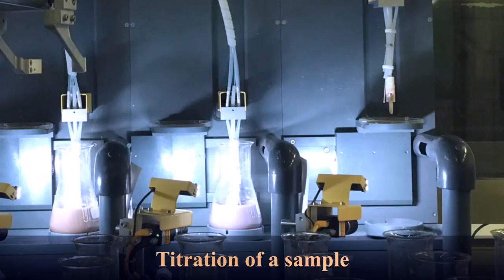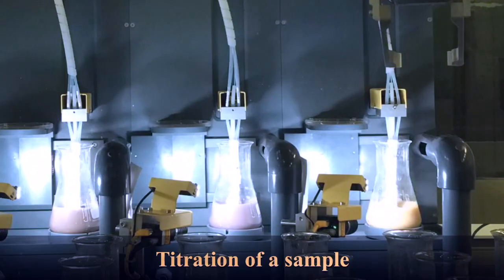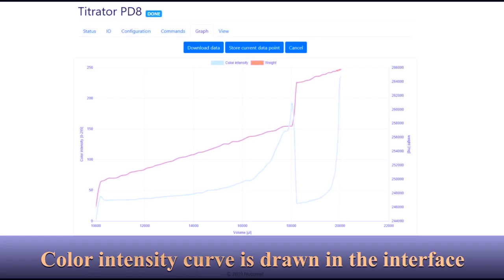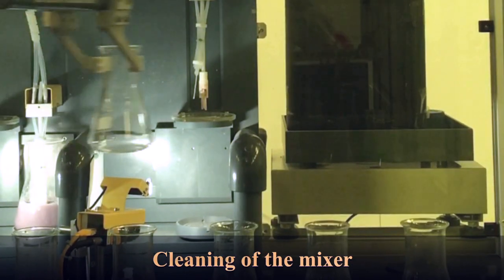Color changes from each reagent addition are tracked automatically through video analysis, allowing accurate determination of the titration endpoint when the deep blue color has faded completely to white. From this titrant volume, the percentage of copper in the sample is calculated with a precision up to 2 decimal places.